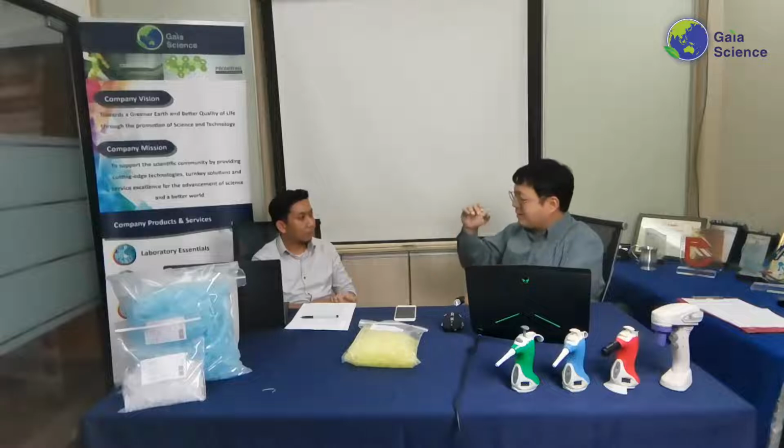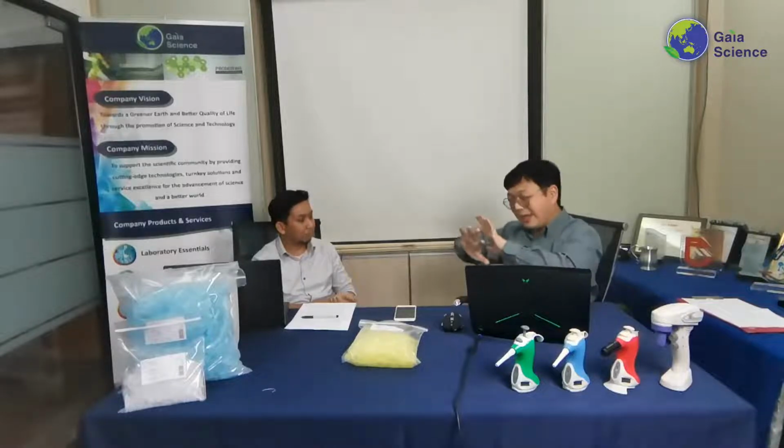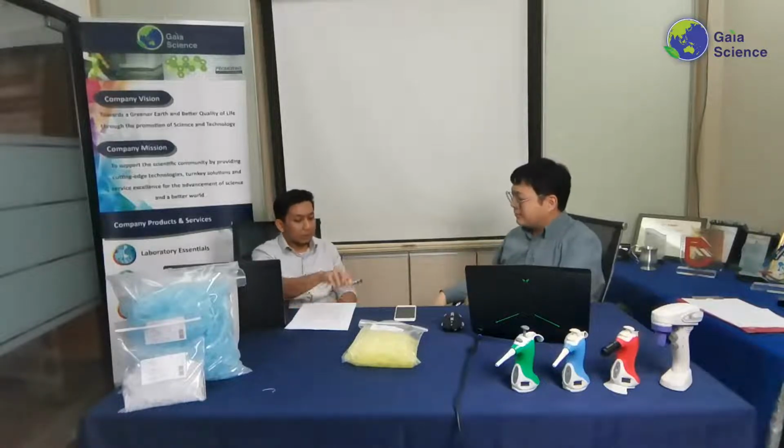That's a good point, actually. Yes, that's also true. It helps in case you do not hold it correctly and it slips from your hand, it pushes up suddenly, it might jump up, and then the filter is like a net that catches it, basically. That's right. Yeah, I think that's good.